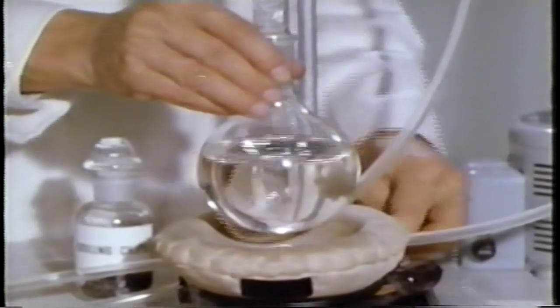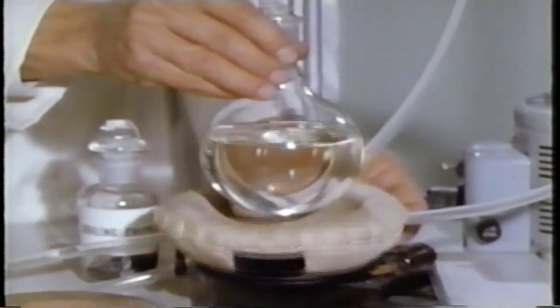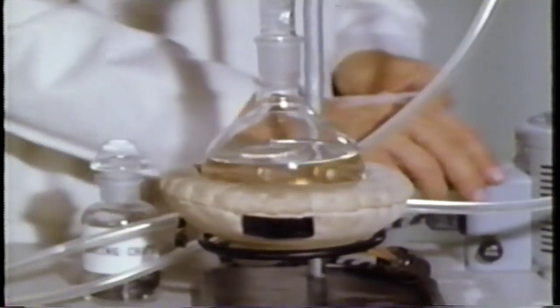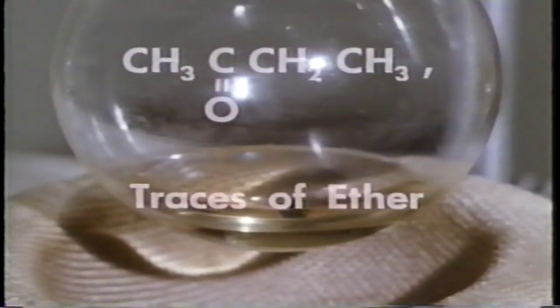Notice the electric heater. Ether vapors are highly flammable, so no open gas flames are used because of the danger of fire. The solution does not take long to boil. The boiling point of pure diethyl ether is 34.6 degrees Celsius. The ether vapors condense in a water-cooled coil and collect in this receiver. Eventually, the temperature starts to rise above 35 degrees, so most of the ether must have been distilled. The material remaining in the distillation flask is the ketone plus residual ether.